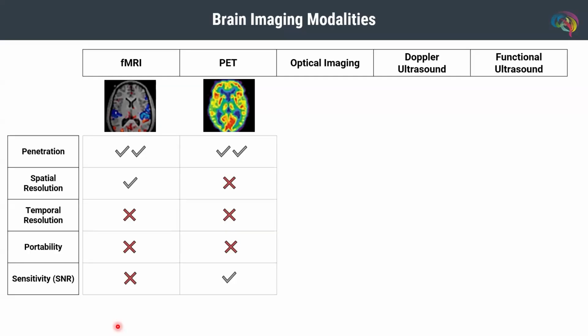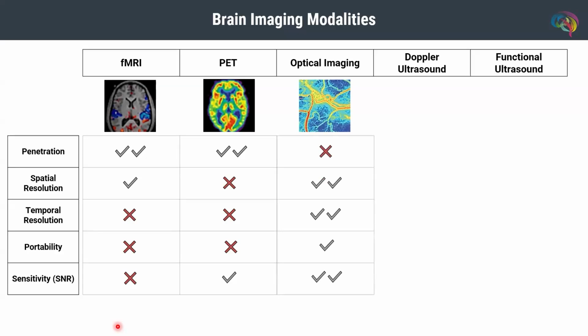On the other hand, we have optical imaging techniques that provide outstanding spatiotemporal resolution and good sensitivity, but their penetration depth is limited to the superficial cortical layers or to very small fields of view, again limiting their application for some specific experimental questions, right?